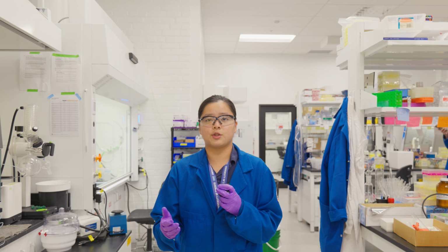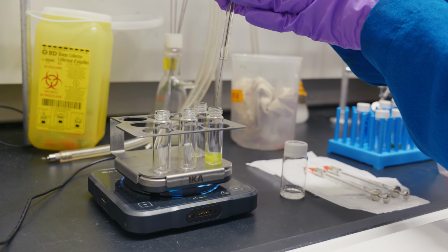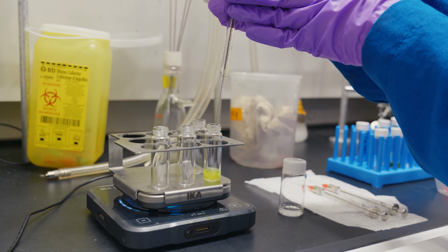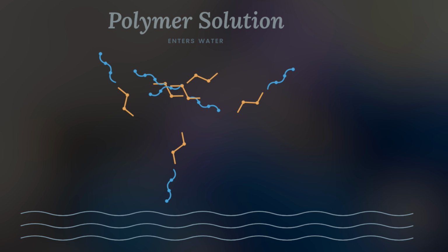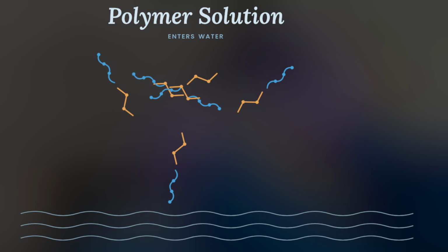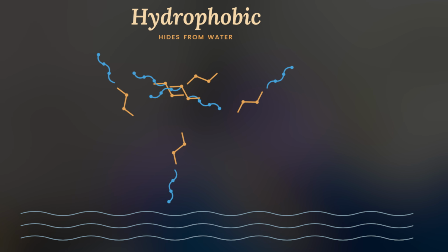You'll notice that I have a stir bar making a vortex in the water. This is so the polymers rapidly get dispersed in the water and result in many small nanoparticles versus a few large aggregates. When we drop the polymer solution into water, the more hydrophobic parts of the polymer are plunged into a bad solvent and want to hide from the water.